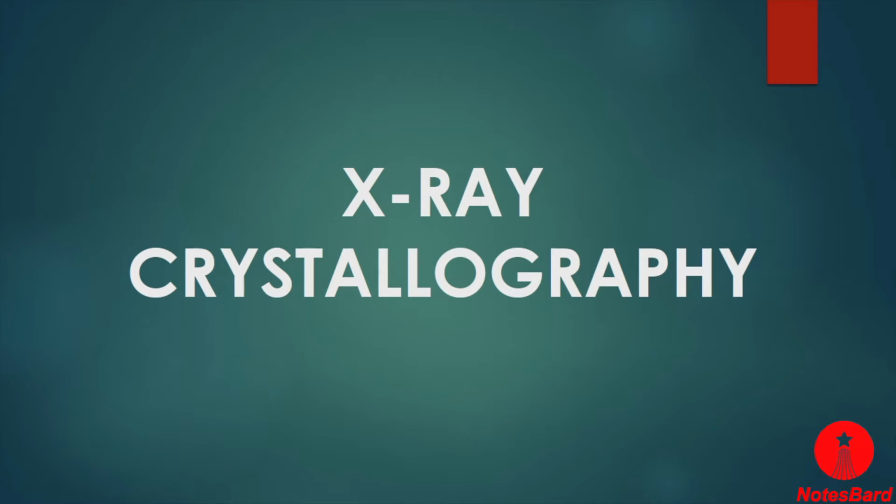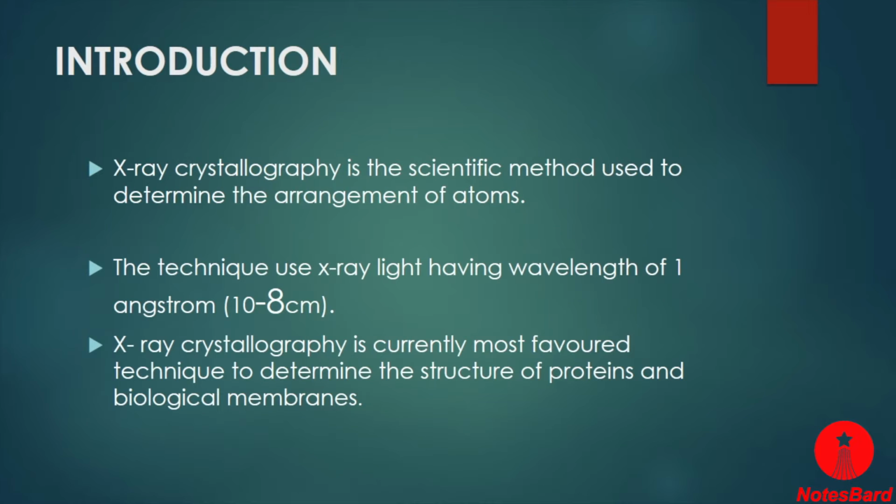In this video lecture we will discuss X-ray crystallography. So let's start with the introductory part. Basically, X-ray crystallography is an experimental scientific method which is used to determine the arrangement of atoms. This method is used for determining the atomic and molecular structure of any crystal, in which the crystalline structure causes a beam of incident X-rays to diffract into many specific directions.